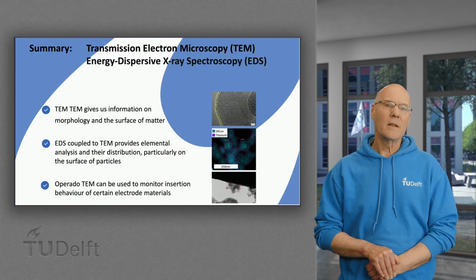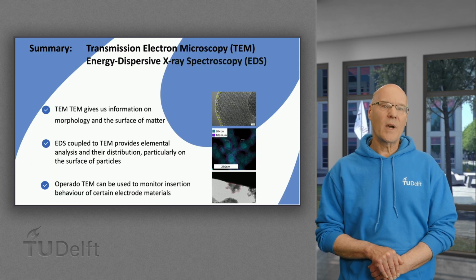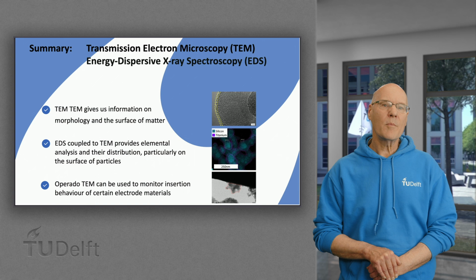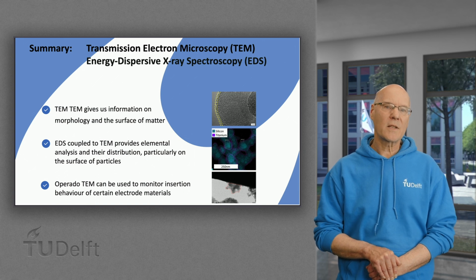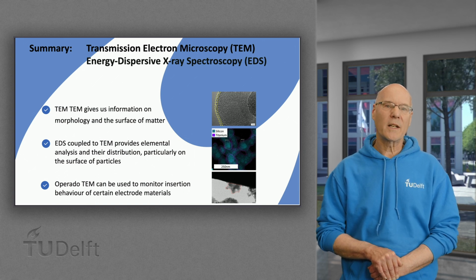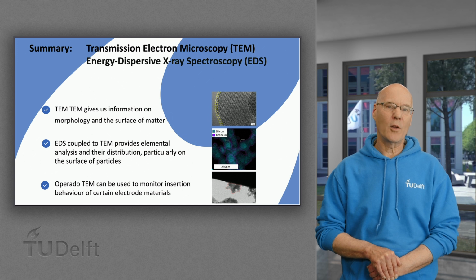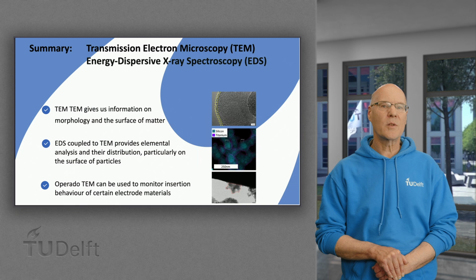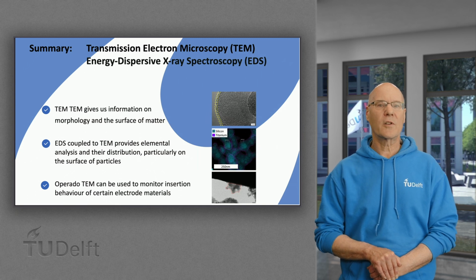In summary, TEM gives us information on morphology and the surface of matter. EDS, coupled to TEM, provides elemental analysis and the distribution, particularly on the surface of particles, and operando TEM can be used to monitor insertion behavior of certain electrode materials.